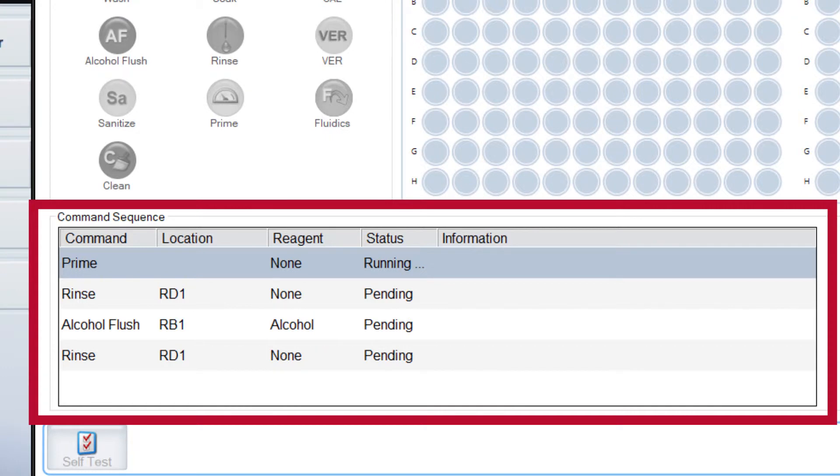Followed by an Alcohol flush, which removes air bubbles from the sample tubing and the chamber using 70% isopropanol or ethanol.